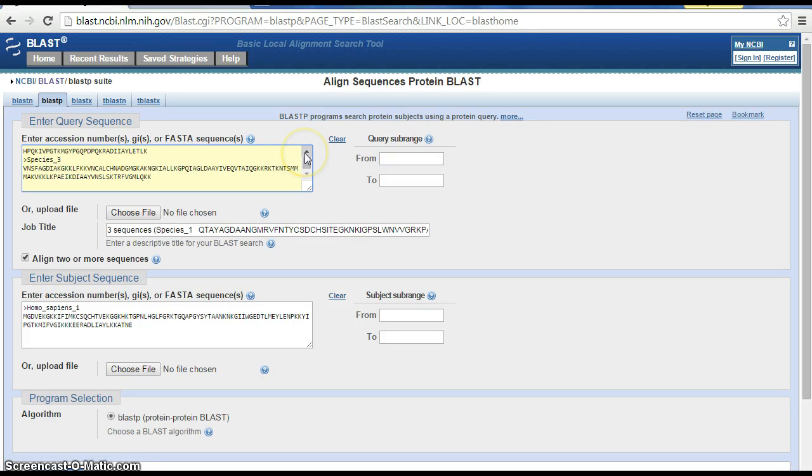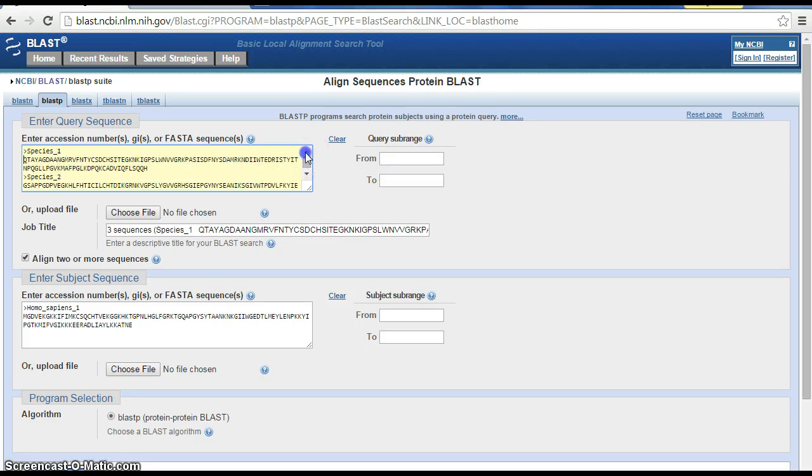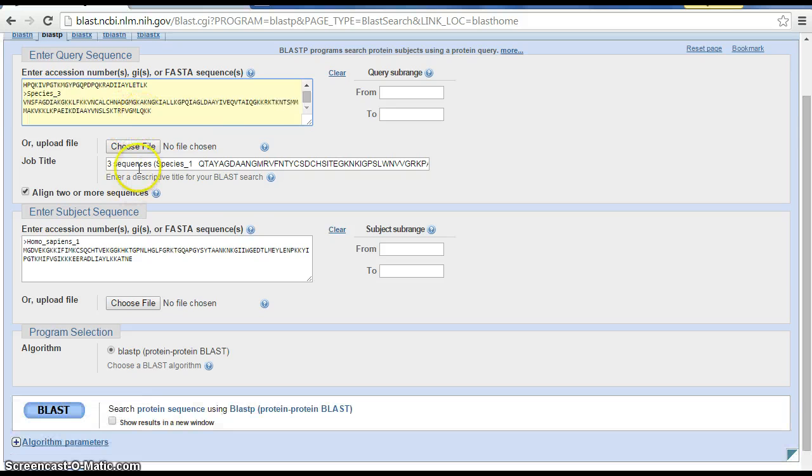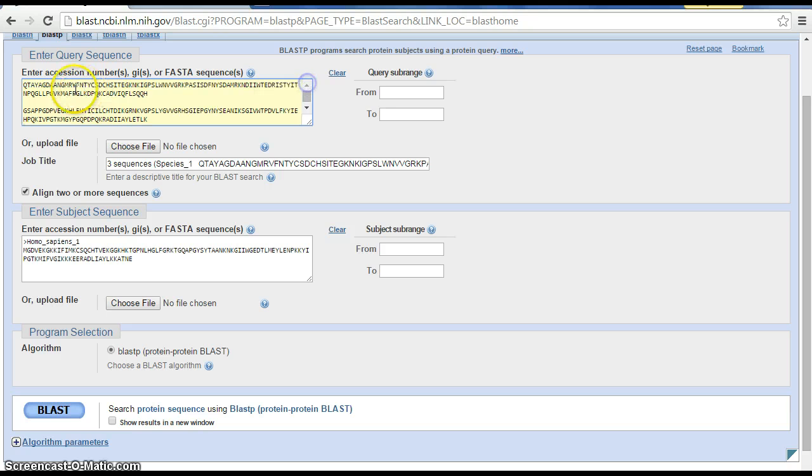We scroll up and get rid of the names, so we're left with just the amino acid sequences. We'll remember that we put them in an order of species one, two, and three, and let's go ahead and BLAST.